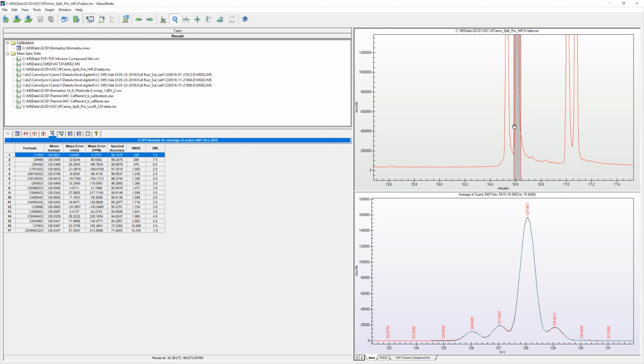And then on Wednesday, Yongdong will be presenting an interesting case similar to what we're talking about here, except we have very closely resolved bands, and even on a low resolution instrument, we can identify the correct compound type by using this concept of spectral accuracy and line shape calibration.